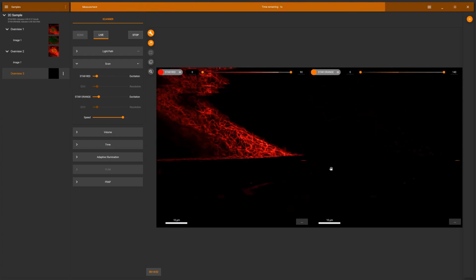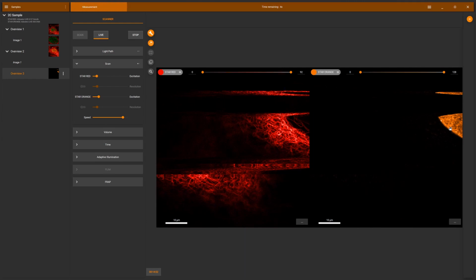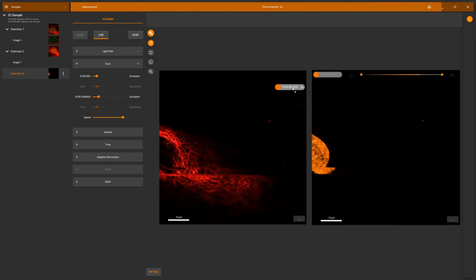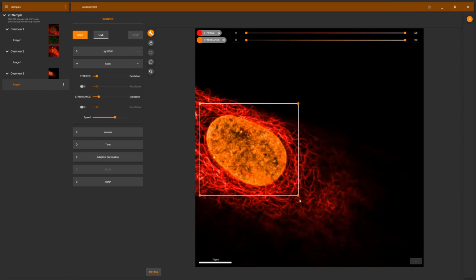Let's go here. There's another one. I drag it to the center with the mouse. We overlay them again. And here I select the second region. Maybe this nucleus is a little bit turned, so I will turn it as well.